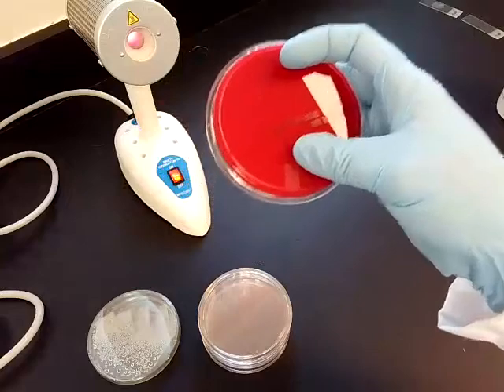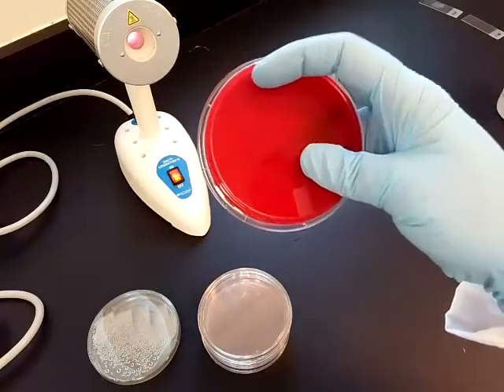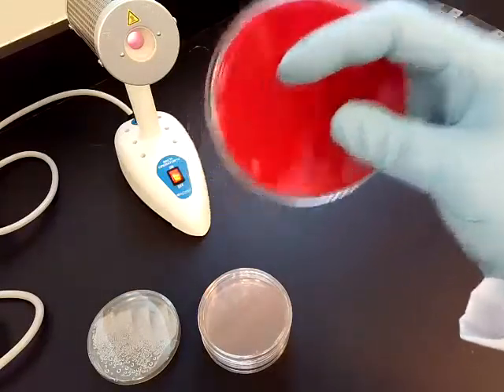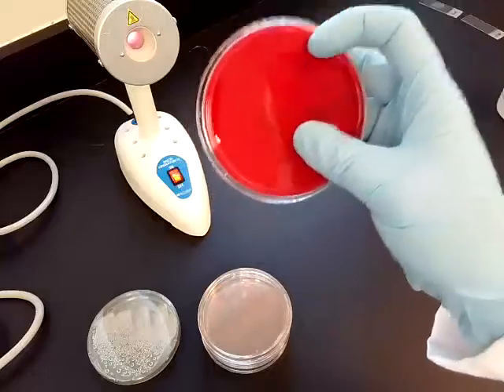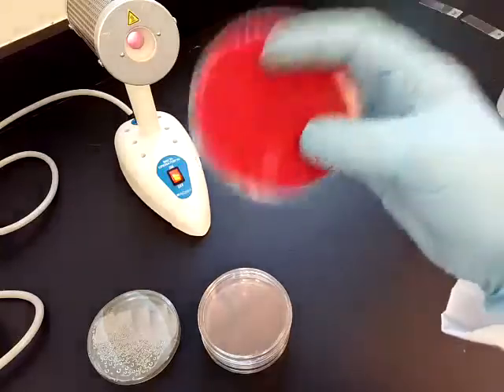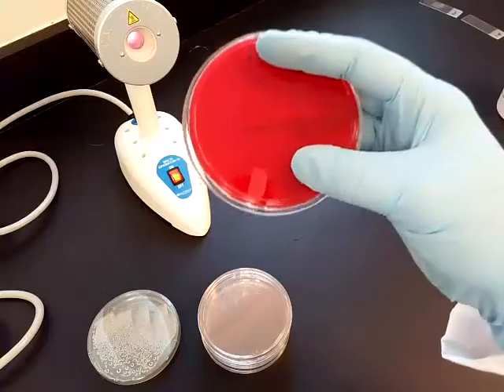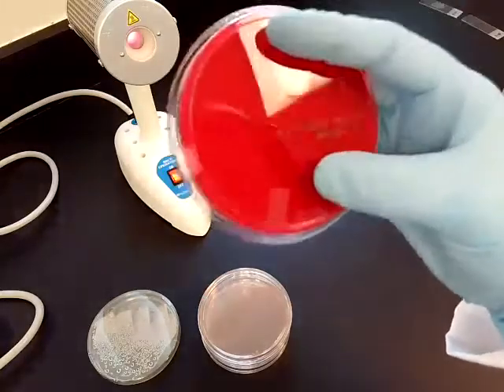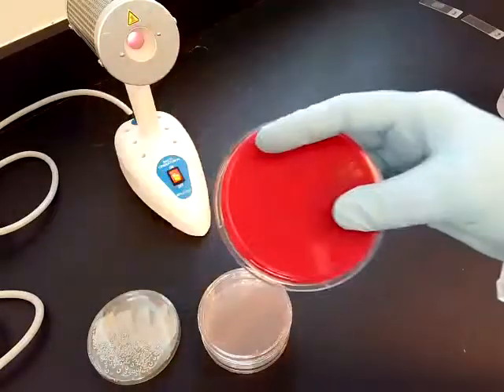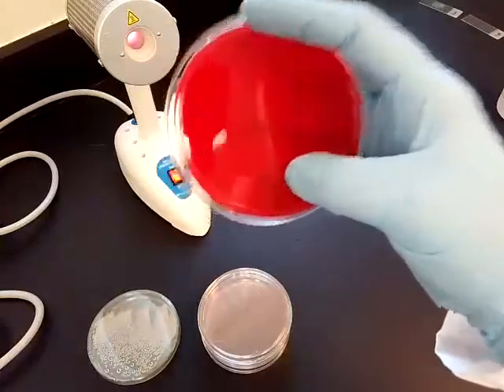The other type of hemolysis would be beta hemolysis, and beta hemolysis is complete hemolysis. You would see a yellowish hue to the microorganism in the agar surrounding the microorganism, or you might be able to pick it up and hold it up to the light and be able to see all the way through. Because it can differentiate bacteria based on the hemolysis, this is known as differential media. It is not selective media. Pretty much everything that we would like to grow will grow on here, with of course some exceptions, but most microorganisms are going to grow just fine on this.